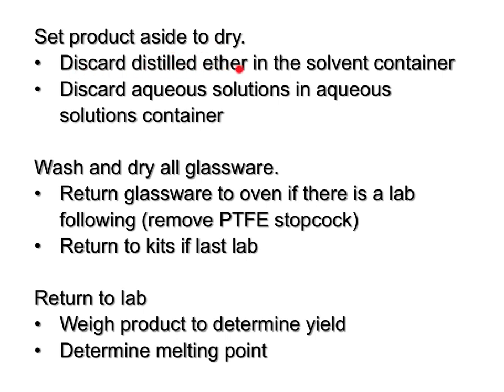You'll discard your distilled ether in the solvent container. Also, the hexane filtrate, right, should go in the solvent container. Your aqueous solutions we will collect, right? We will have a container for the aqueous solutions, those magnesium chloride salts.